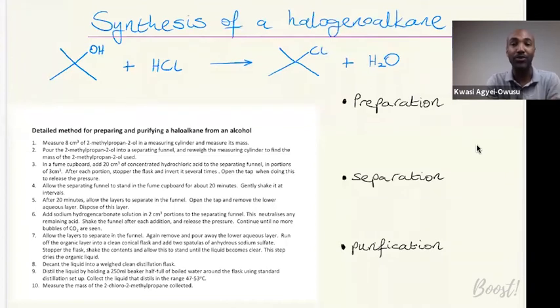And of course, if we wanted to delve deeper into the reaction and mechanism, for instance, we would be thinking about nucleophilic substitution, where your chloride ion is your nucleophile and water is eliminated. Okay, so how is this reaction carried out? Well, we can break down the reaction into constituent parts to make our understanding of the different steps in the procedure a bit more secure.